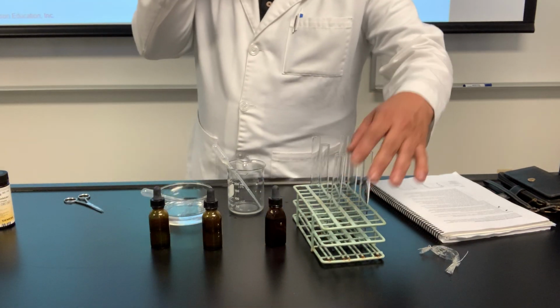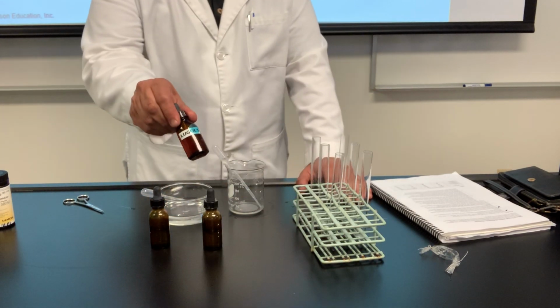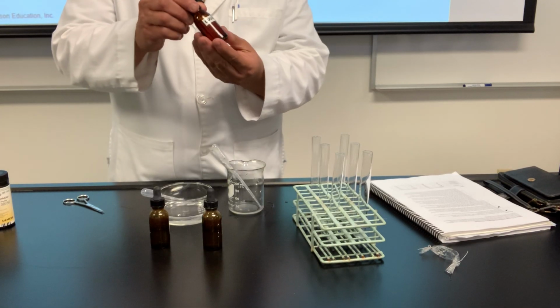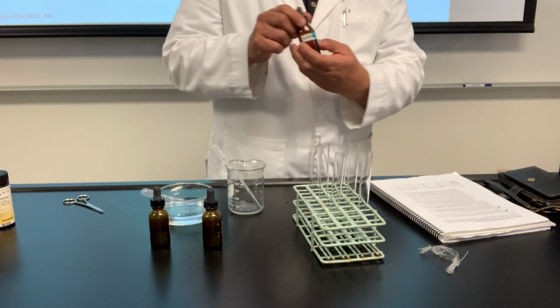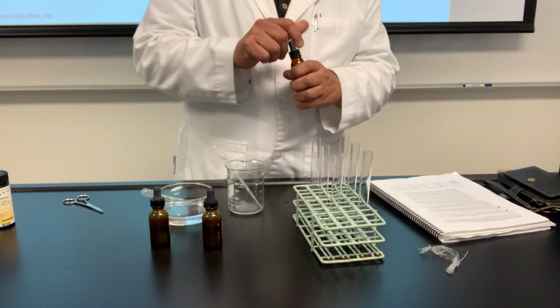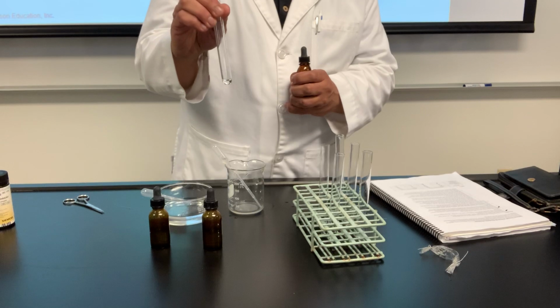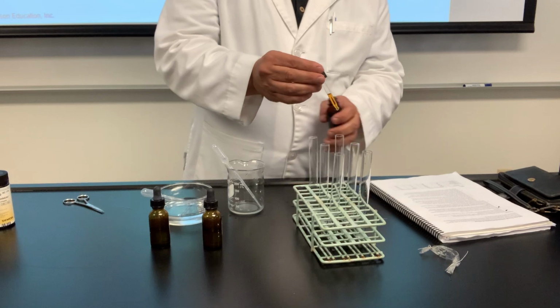Okay. Now, the lab manual tells you that to test for starch, we're going to use Lugol. We did this before. When we did the potato, remember the potato? You added Lugol and you produced that purple color. Do you remember that? And that's the same color that we're looking for here. If I add this indicator to the solution, and it has starch, it will turn that bluish color. Well, what's your prediction? This is the inside solution. Does it have starch? Yes. This is the outside solution. Should it have starch? No, because it's too big.